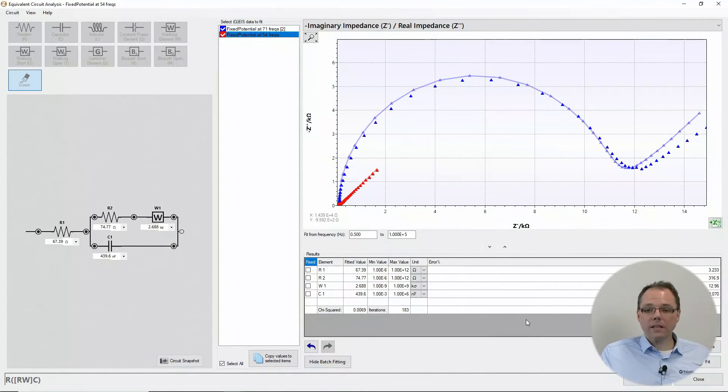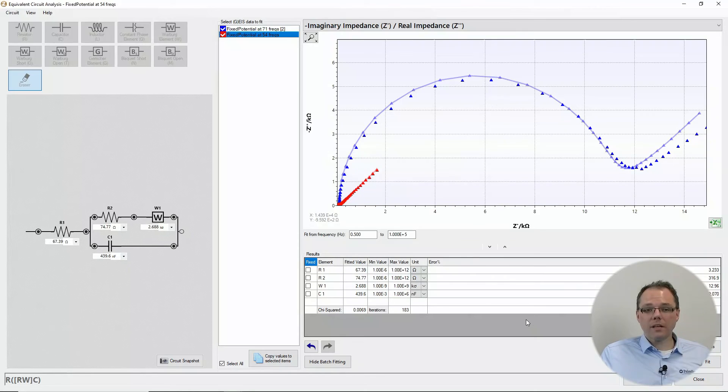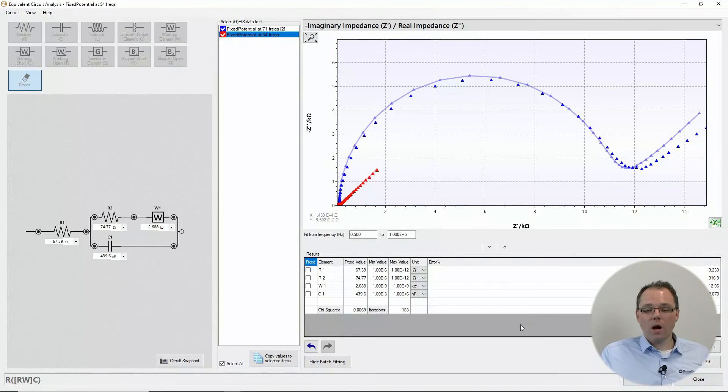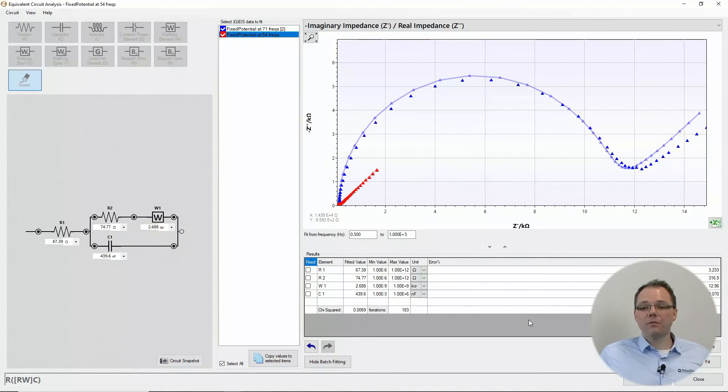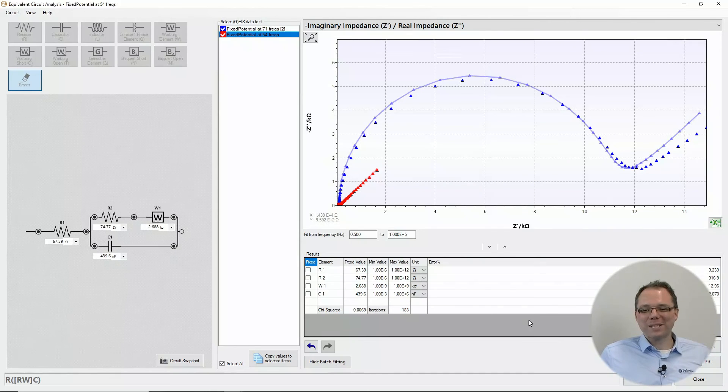That is actually everything that I want to tell you right now about circuit fitting. I leave the rest to your exploration.